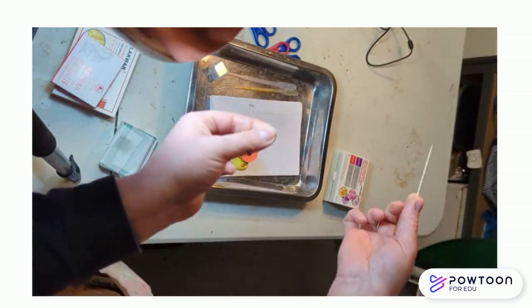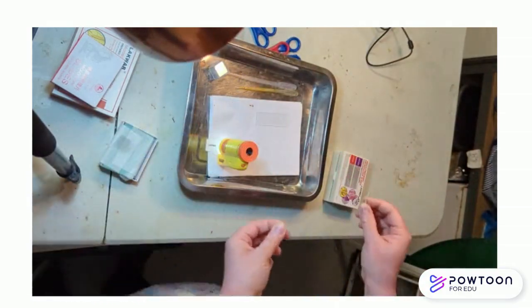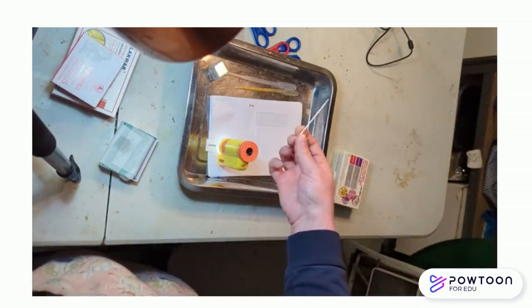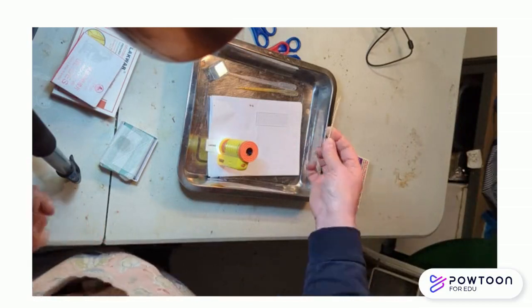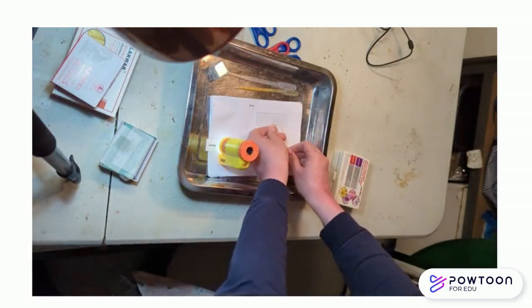Now, I don't know about you, but I am not very dexterous, so I'm a bit of a disaster. So this is my coping technique. I use this, I don't know, this little stick. It could be also a little bigger. Make sure they're definitely wearing goggles while they're using this. You do not want anyone being poked in the eye.